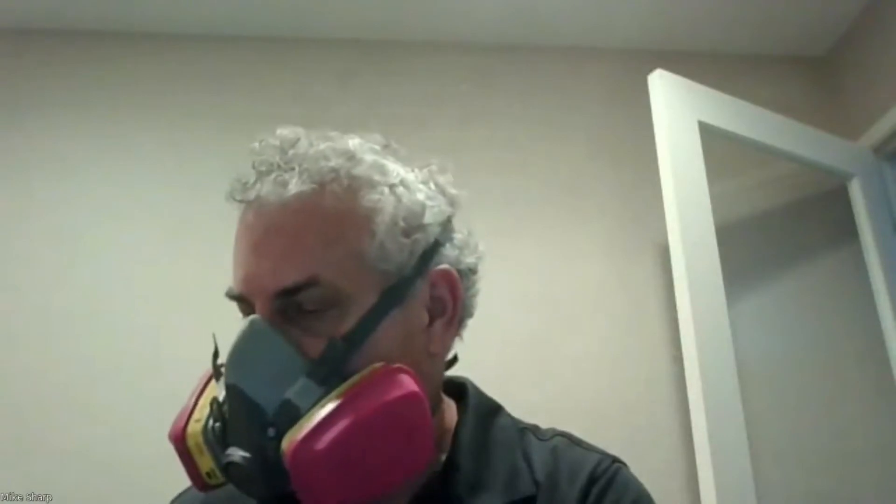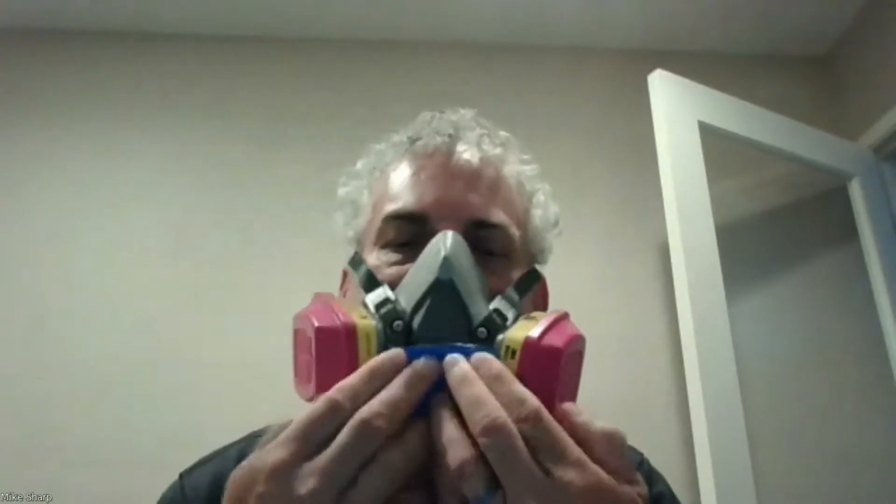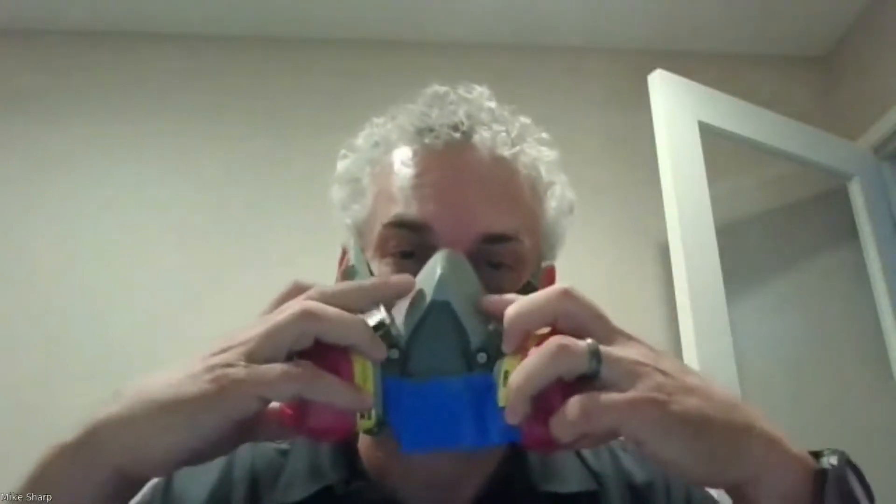Next, I'm going to cover the exhalation valve. On this mask, I can't cover it with my hand without pushing the mask into my face, so I'm going to cover it with a piece of duct tape. Once I have the duct tape on, I will attempt to breathe out, and you'll see the mask poof up. You'll feel the respirator poof up before you feel it blow into your eyes.